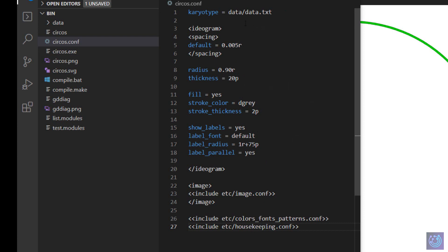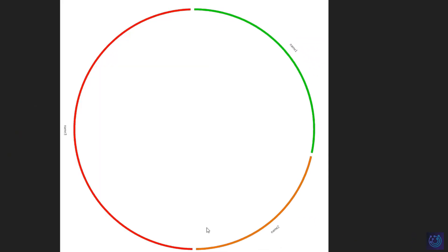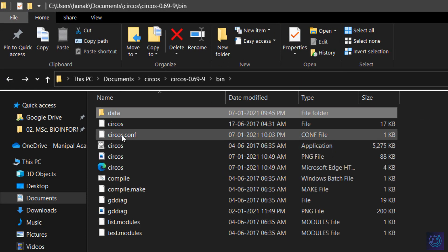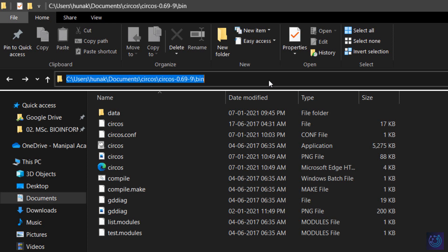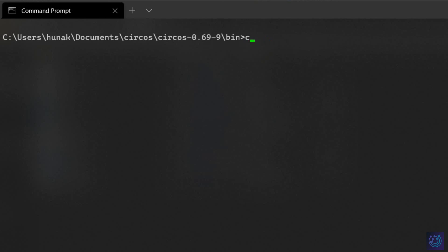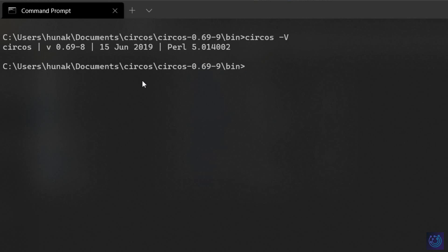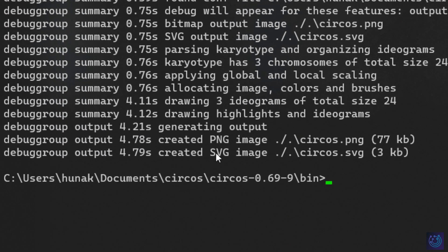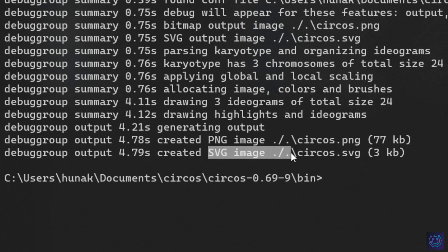Save the configuration file. We now have the 'data' folder with the data file and 'circos.conf' in the bin folder. Open a terminal, cd into this folder, and confirm the installation by typing 'circos -V' — this gives us the Circos version. Next, type 'circos -conf circos.conf' and hit Enter. At the end of this process, two images will be created — one PNG and one SVG — both in the same bin folder.